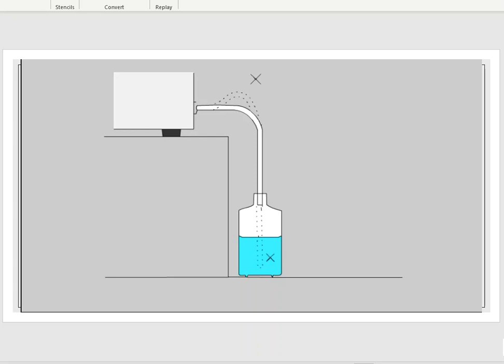For us, it's just a simple bucket. For other people, it might be like a 4-liter jug that you would see some reagents come in. Instead of throwing those away, they might reuse those as drain containers for equipment, and TOC could be one of them. But what you're seeing here is the TOC instrument up here at the very top, and of course this hose is from the drain pot. And that hose will take all of that extra moisture and all of that extra sample that doesn't get converted over, and it drains it out of the machine and takes it into a container that sits down on the floor.